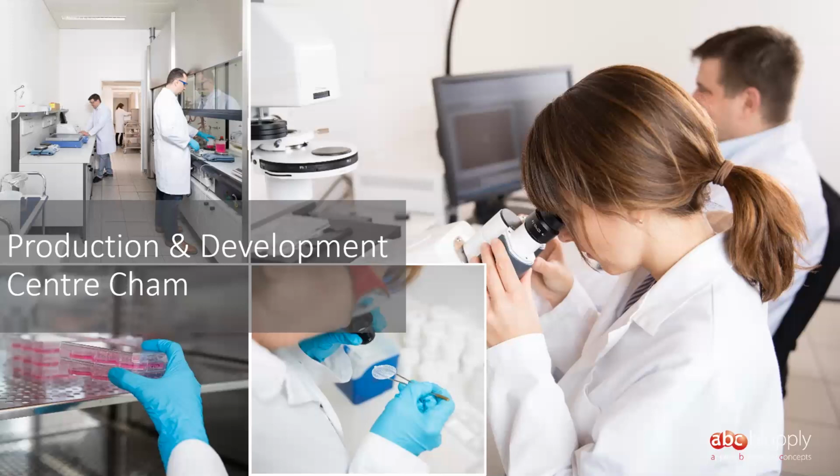Another question is, we are interested in doing some transcriptomics and profiling at the end. Is it possible to access spheroids for that purpose? Yes, indeed it is. Harvesting is a very nice way to get access to all spheroids.